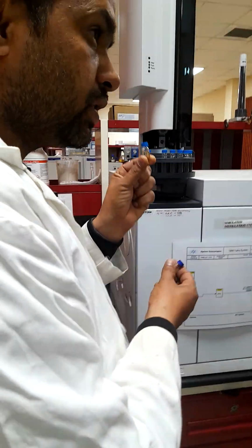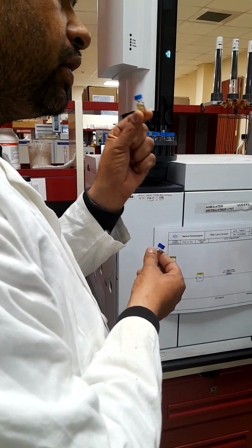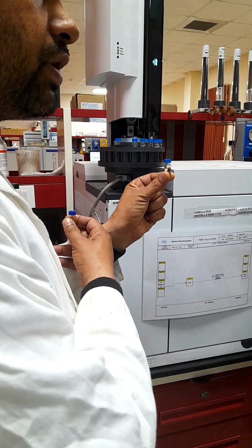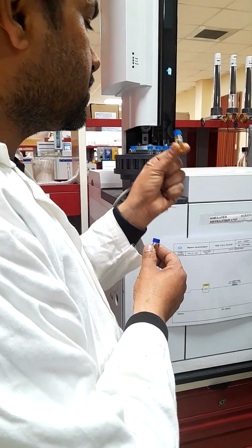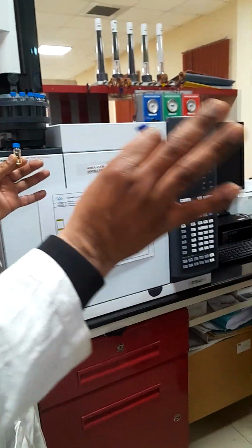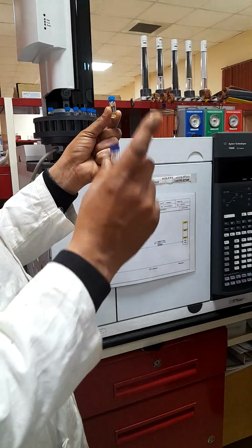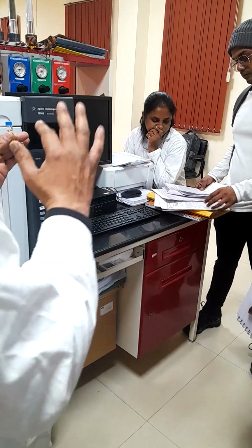The must-notice thing before preparing a sample for injection into your GC is that the sample is 100% or highly soluble in your solvent medium, whichever is used in the blank also. Solubility is a must. In CS2, most of the polar solvent gets dissolved, so we use CS2 here. You can use any one depending on your sample conditions. The solubility is a must there. We prepare this sample at 1 to 2% only, so we get enough intensity of every hydrocarbon. That's why we optimized at 1 to 2%.